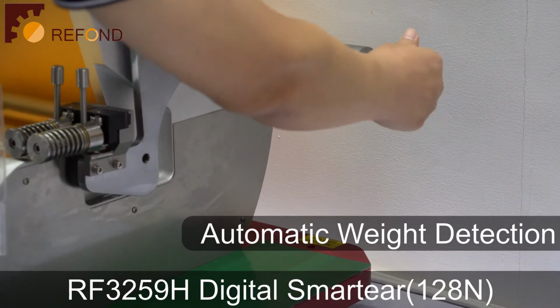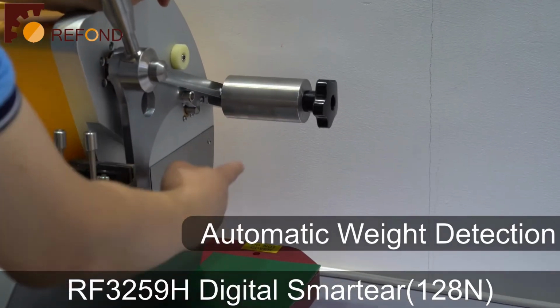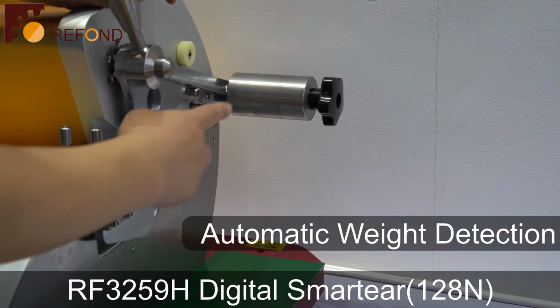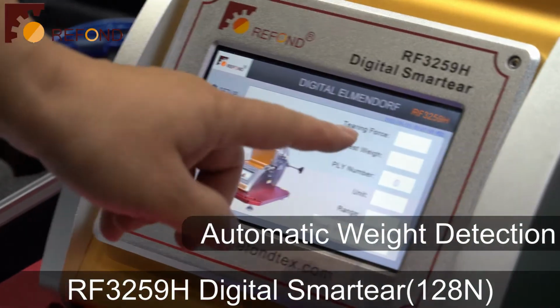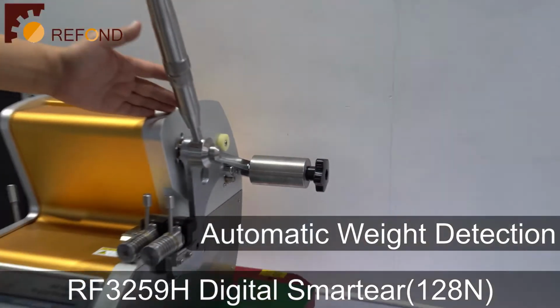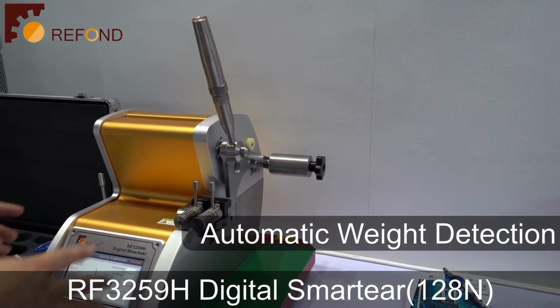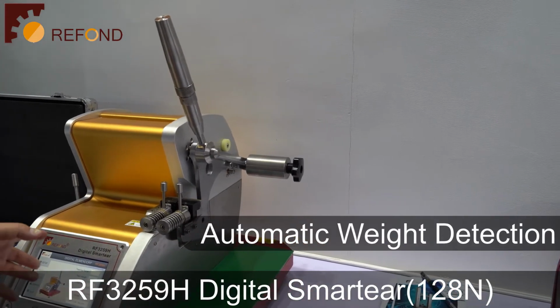The function of our digital tearing tester is that there's a sensor that can detect the size of the test weight. So in the test page, the machine can detect the type of the test weight automatically. So you don't need to set the test weight by yourself.